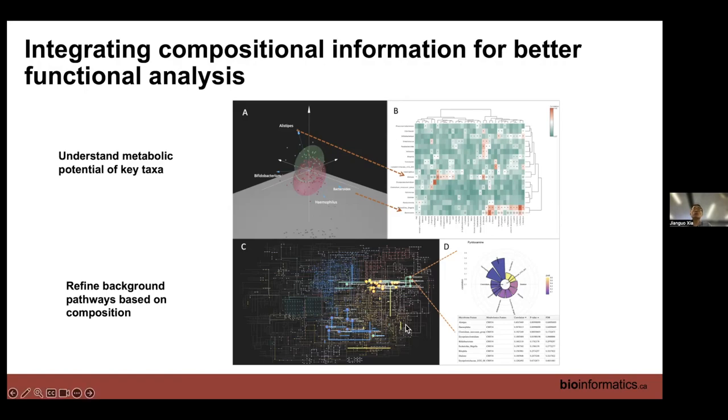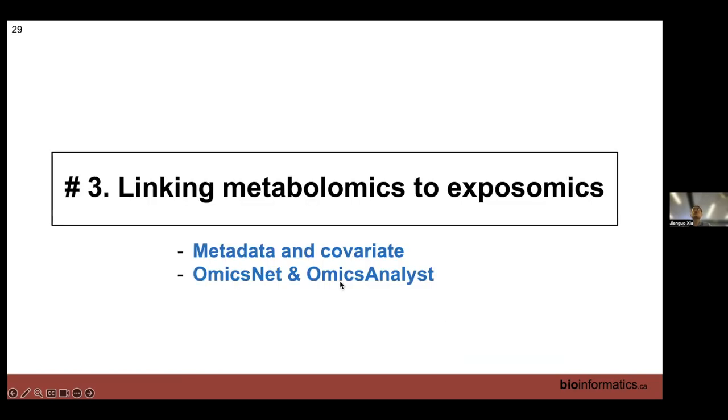And it's up to you to do the next targeted analysis, grow those microbes, or do more isotope labeling to really find out if it is true or not. So a lot of people continue to ask questions like, how do I be 100% sure this one is not that one? This is not what this tool is designed for. For that, you need to do wet lab. Here, we just gave you the leads. This is most likely to be, but it cannot tell you what is 100% sure. This is what omics is: exploratory information and insight, and prioritizing your different hypotheses.